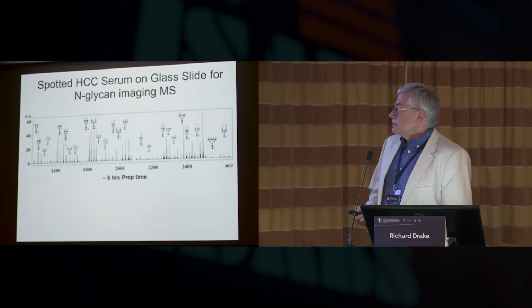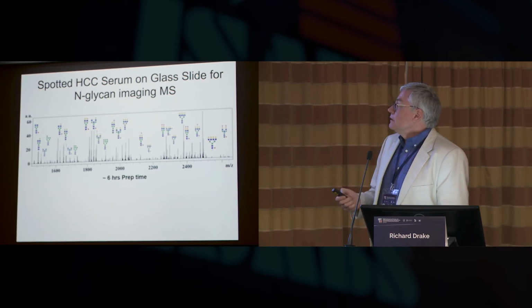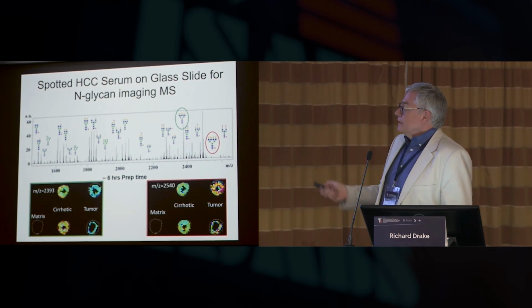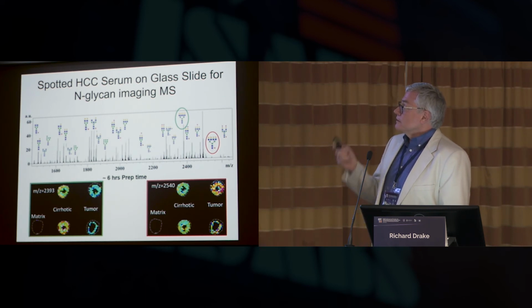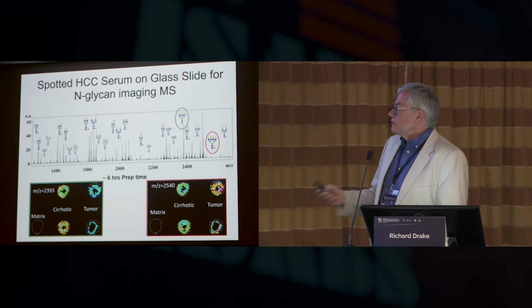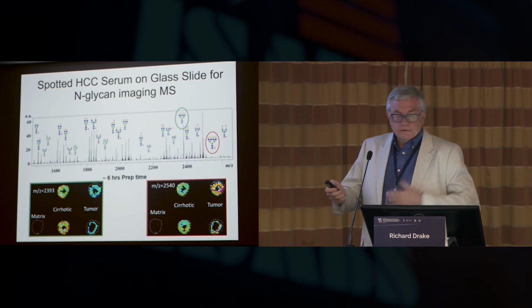We think we can get this into a much faster clinical range with some temperature incubations, probably 2 hours from application to data acquisition. This was a liver cancer example, and it's part of where we're going with our studies: can we look at the serum glycans, the same two I was talking about in the liver cancer tissues, can we start putting them back on the carriers and use that as a diagnostic?